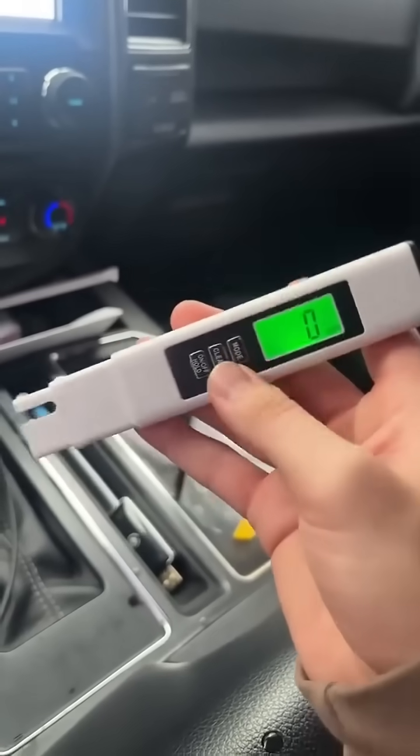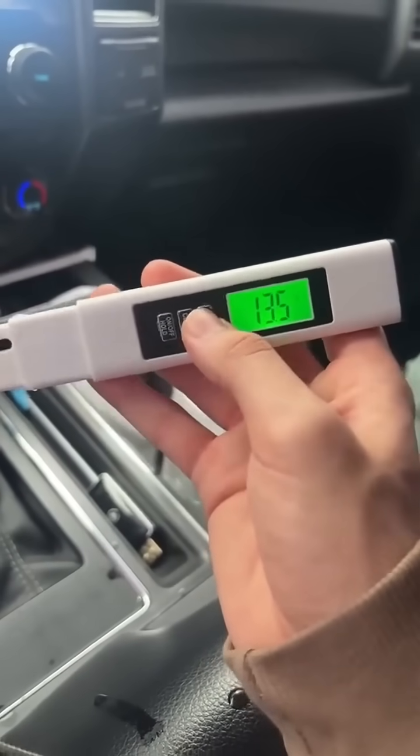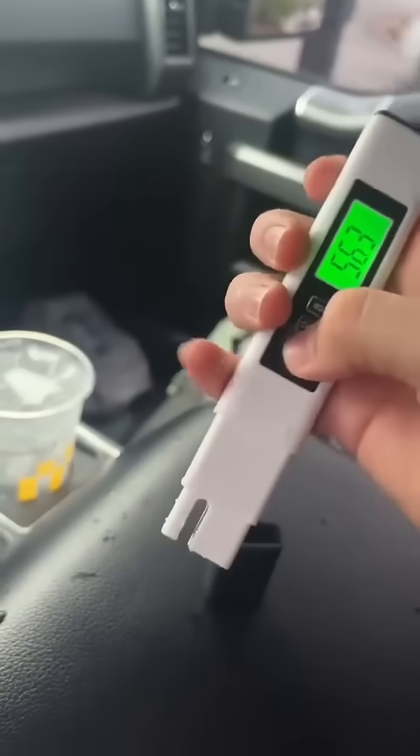This is by far the easiest tool. You can clear it. You can actually set it on different modes to tell how good the water is, the temperature in terms of Celsius and Fahrenheit. When you're done, just turn it off and put that cap right on. The back of the device will show you the purification scale on what number means what in terms of how pure the water is.